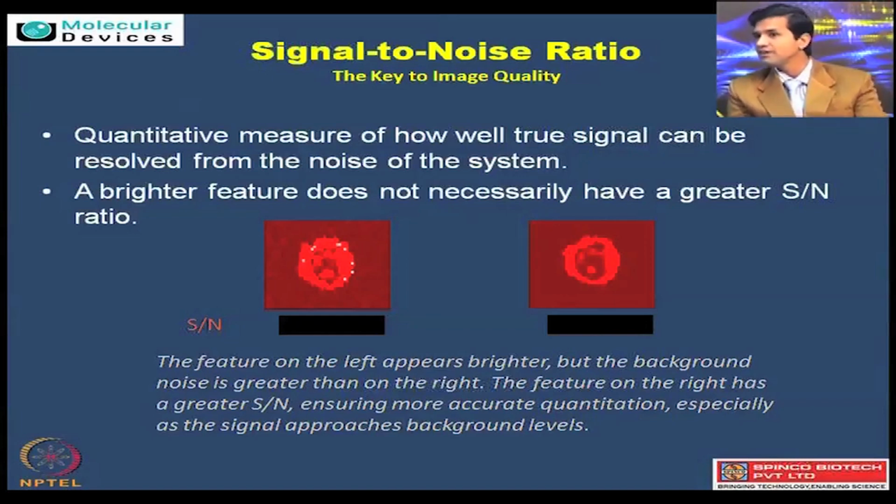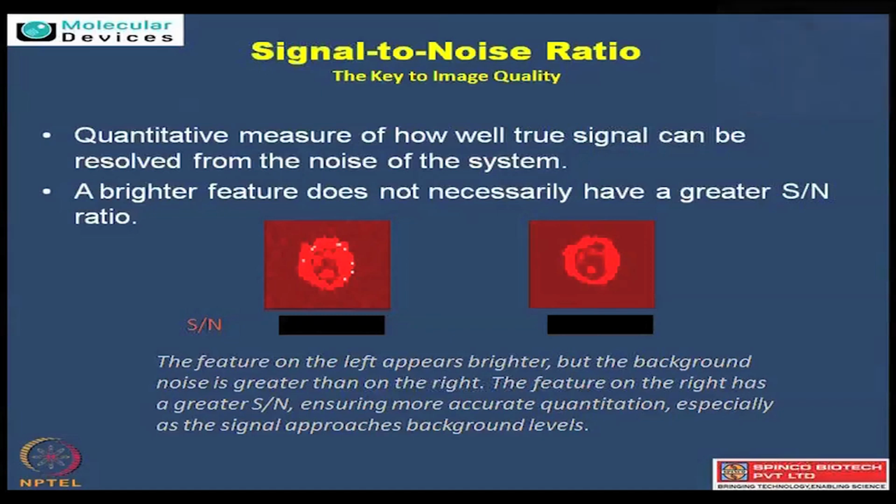Because when you calculate reality based on what you have controlled at the level of PMTs and others, you quickly come to a conclusion that signal to noise ratio can be seen by eyes at the level of PMT, where the laser balance can be seen. So in this fashion, while you are scanning a slide, you can always look at that.